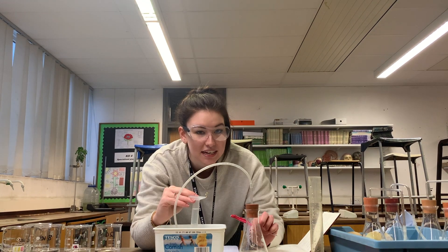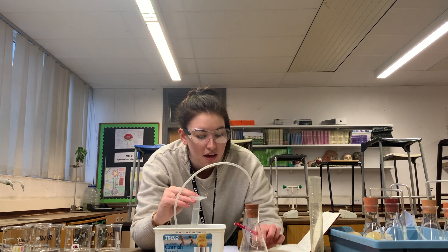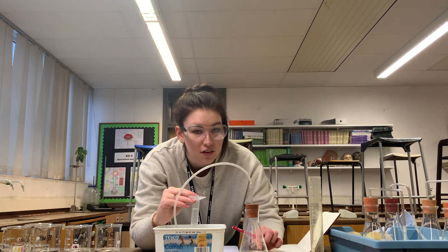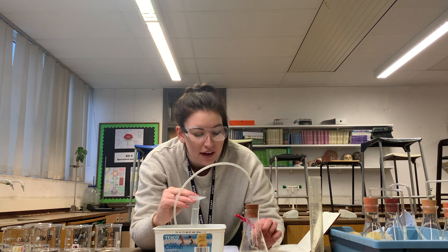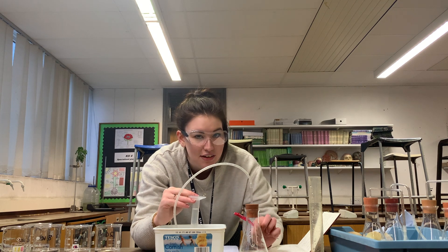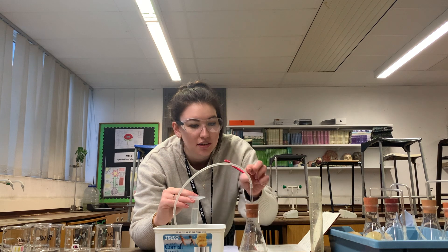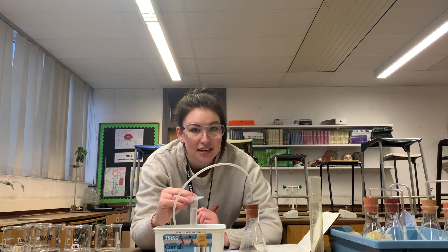The catalase in the potato is reacting with the hydrogen peroxide solution we poured in. This is our lowest concentration of hydrogen peroxide, and that hydrogen peroxide is being broken down into water and oxygen. It's the oxygen that's bubbling through this tube and up into our measuring cylinder.